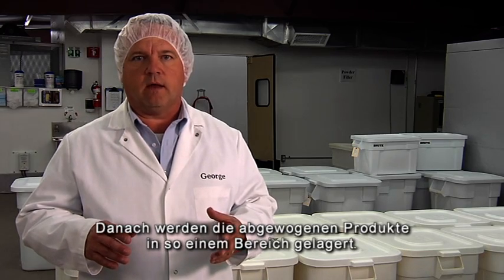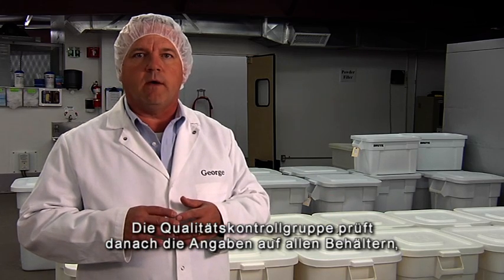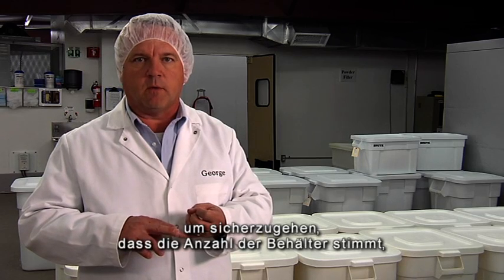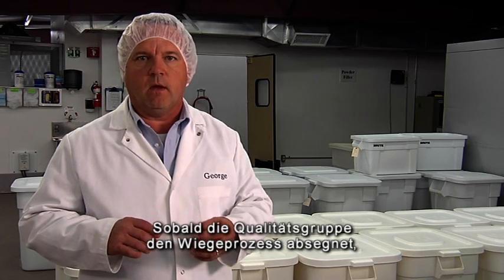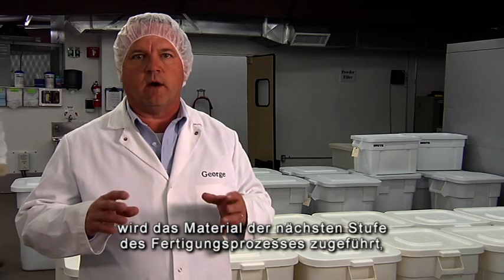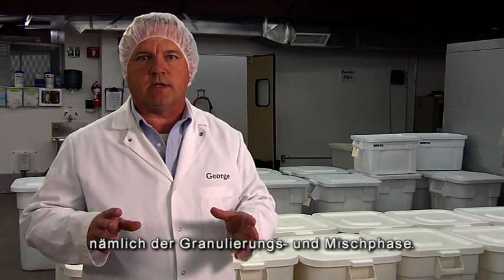The weighed items are then staged in a designated area, and Quality Control will come and verify the information on all the containers — confirming the proper number of containers, the proper weights, and that all containers are identified with the correct item number and lot number. Once Quality Control approves the weighing process, the material is ready to move on to the next step: the granulation and compounding stage.